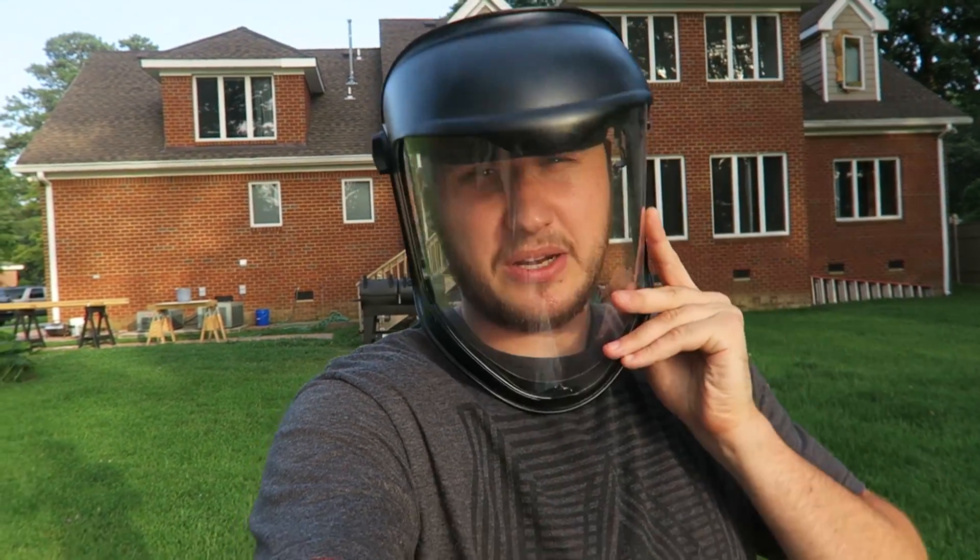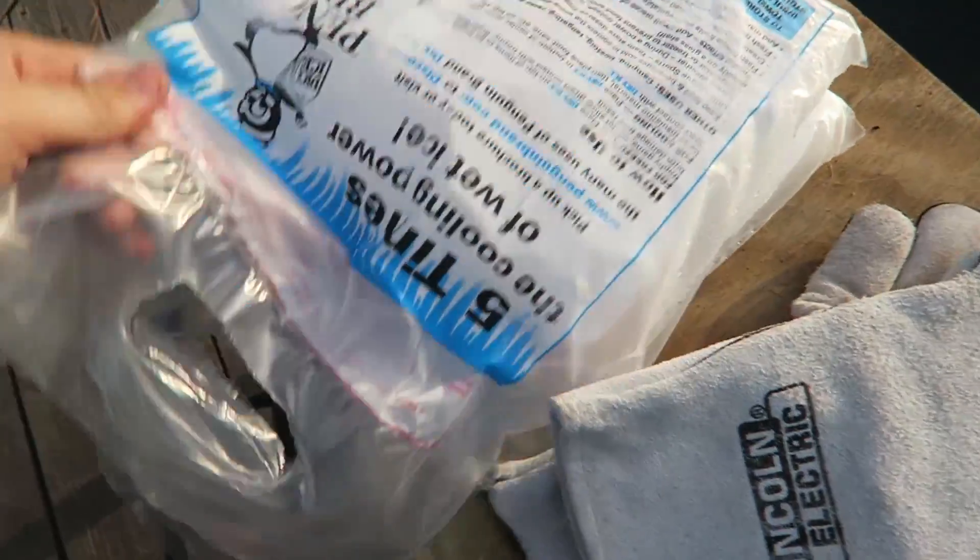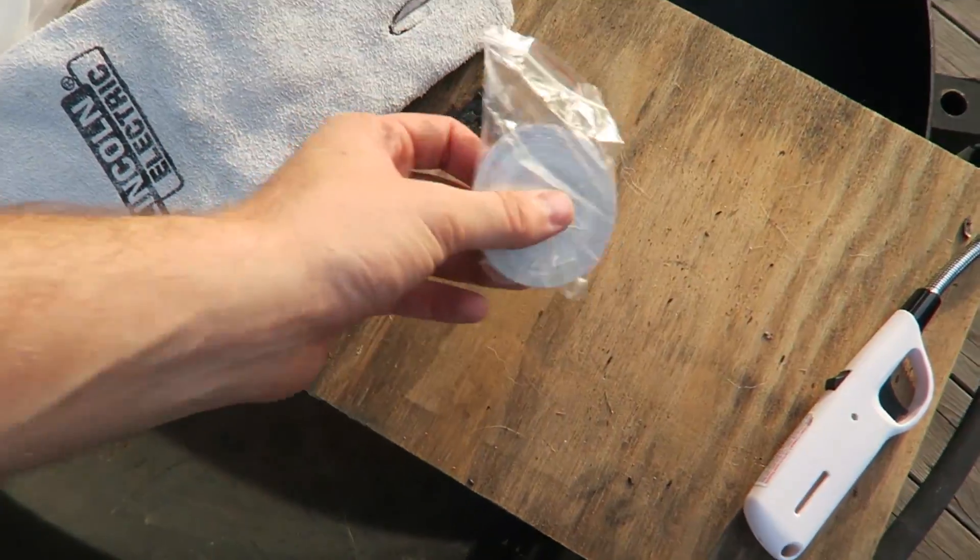What's up everybody, welcome back to my laboratory where safety is number one priority. Today we're gonna be doing a dry ice experiment. I got here two blocks of dry ice and magnesium ribbon.